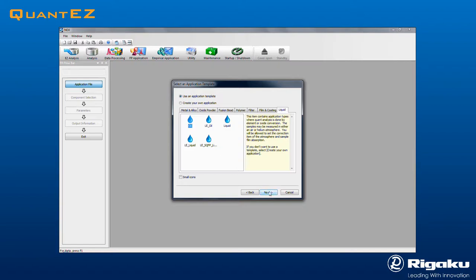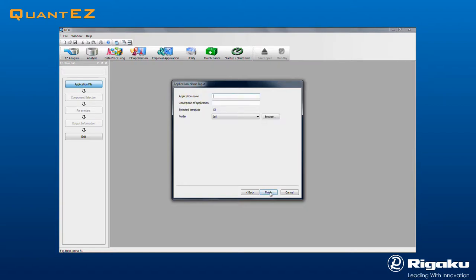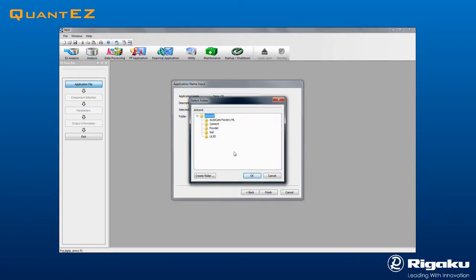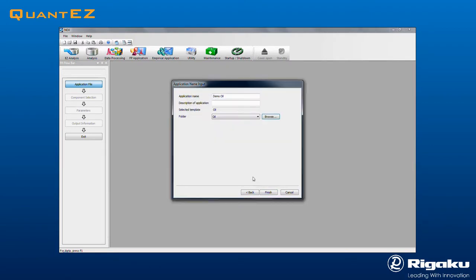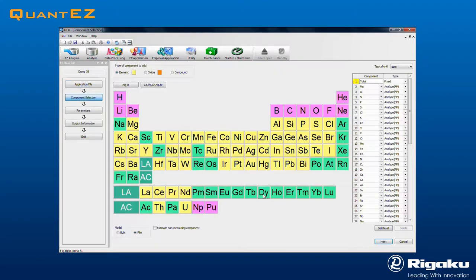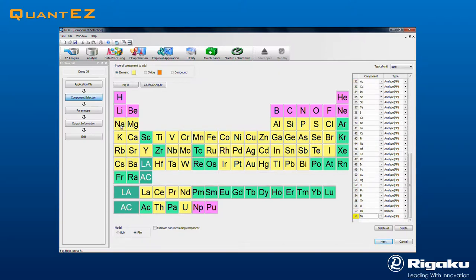Type in a name for the application. Create a folder for data storage and click OK, and OK again. Then click Finish to move down the flow bar to the Component Selection screen. The Oil template comes pre-populated with all the common components for oils, which are shown in yellow.